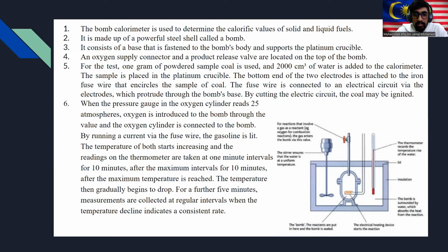And then later, through this combustion, as you can see in the diagram, there'll be a fuse wire, and this fuse wire will be burnt, meaning that the electric circuit will be cut off after that. So that is just a short procedure of how to conduct this experiment.